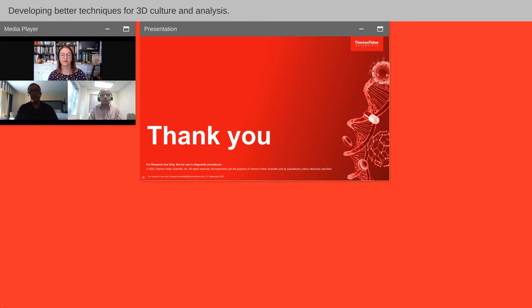Okay, thank you. And the last question for Edwin, can you share more about the kind of controls you have in place or parameters you are measuring to ensure the reproducibility of the neural organoids generated in the lab? Yeah, I think this question has been asked in the field as well. In general, I'd recommend that depending on the model, you develop some general QC parameters to help with those types of consistency issues.